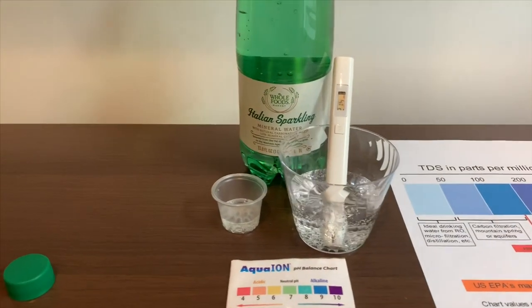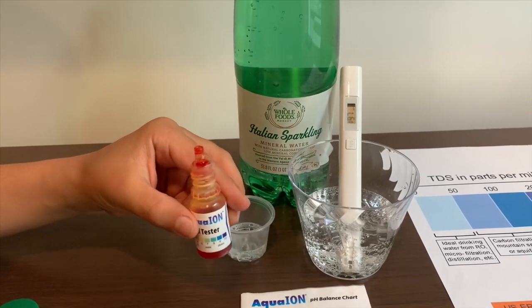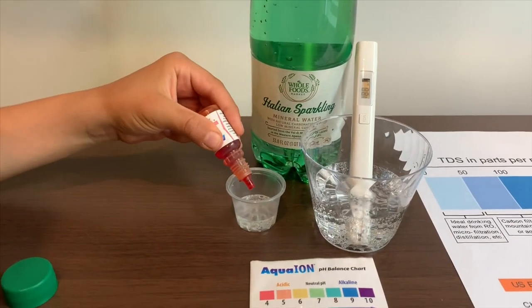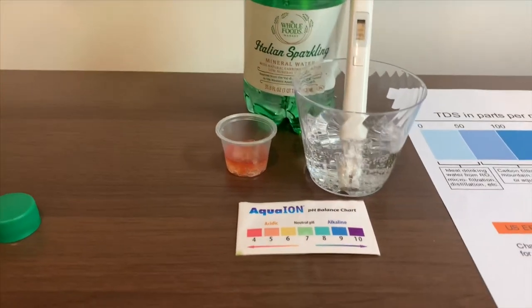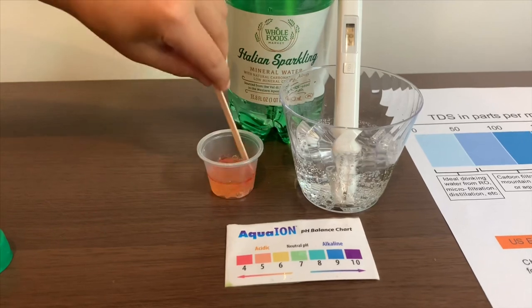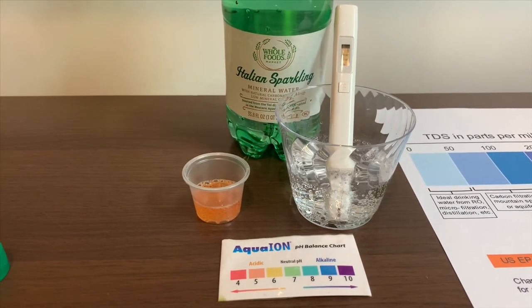Now, let's test the pH level. If you want to buy this pH tester, check the link down below. Only do two drops. Let's stir it a little for a better result. It's a five — this is acidic.